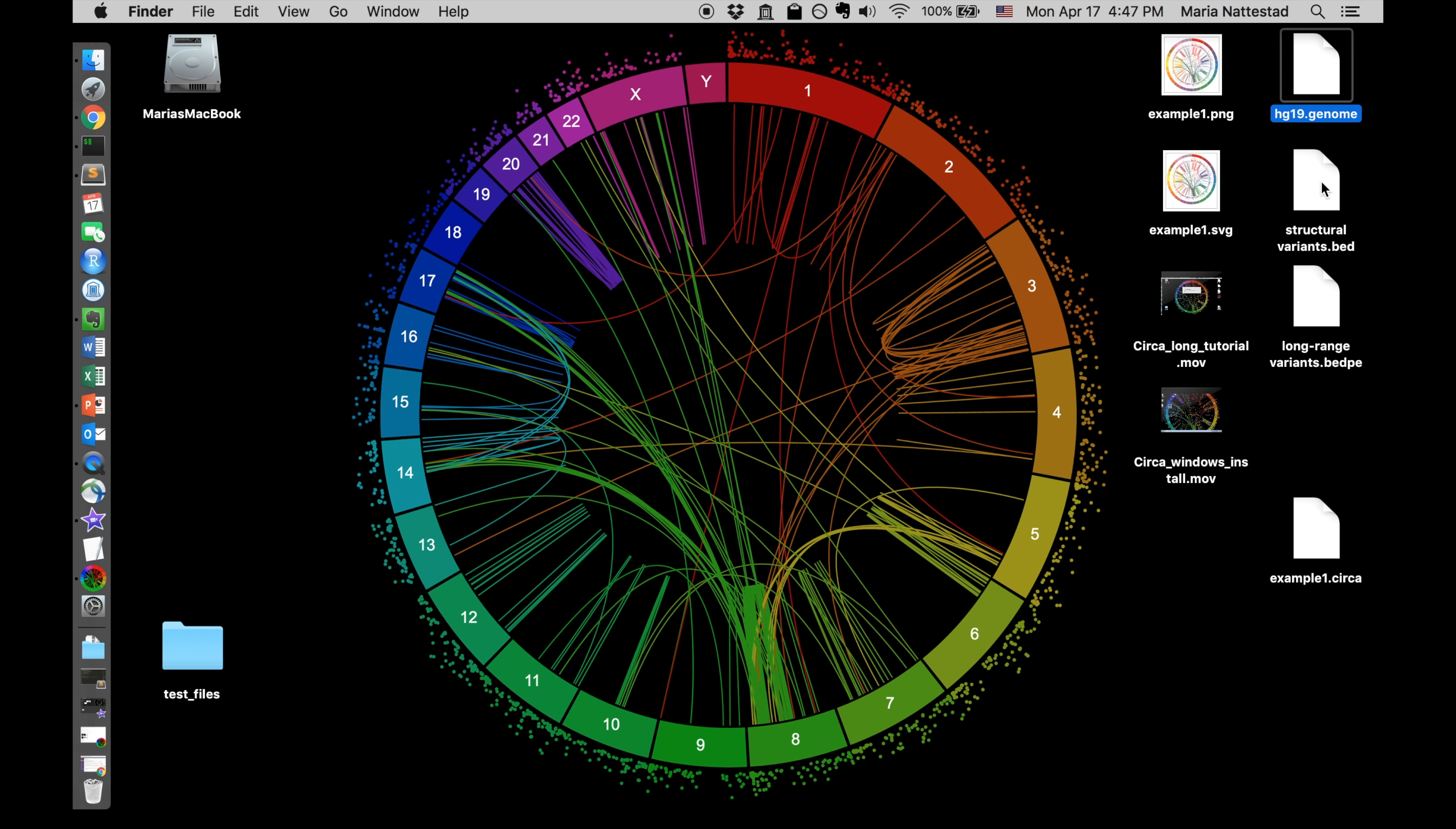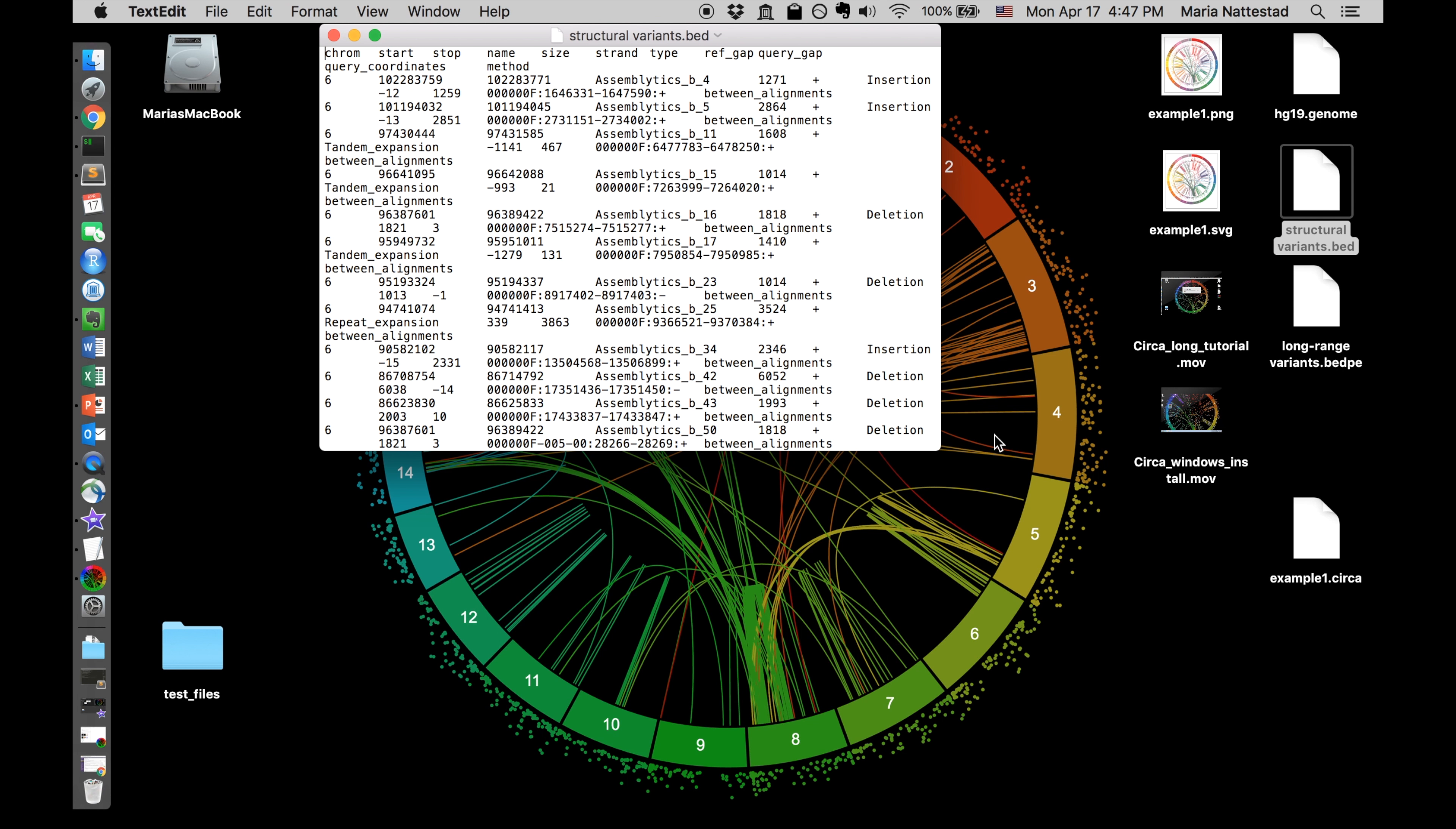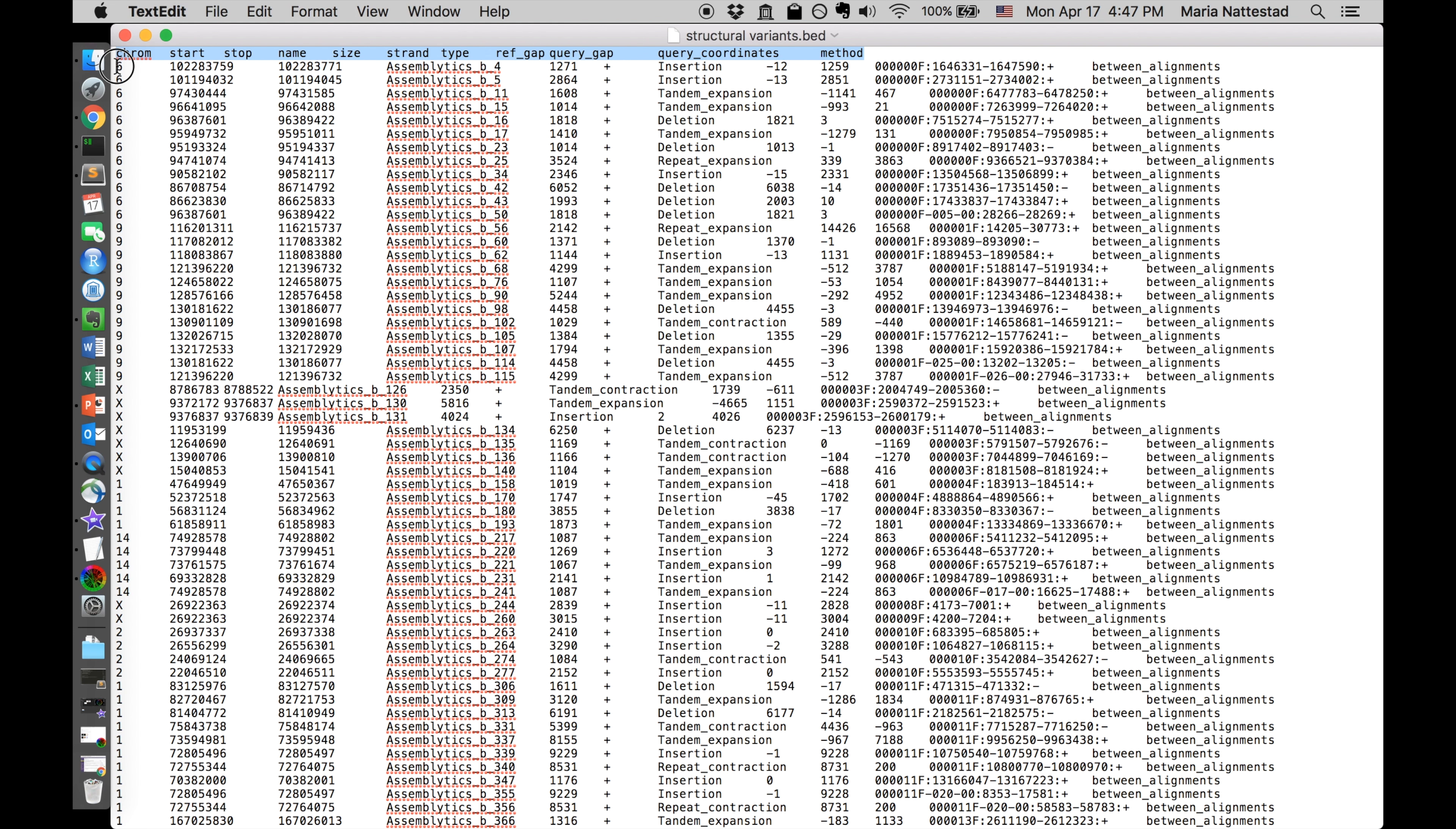Another file that we can look at is a bed file of structural variants. Let's drag that into text edit as well and I'll open that up. This one's a bit more complicated as you can see, and these are just different variants. Again we need to have a header and we have all these different pieces of data in here.